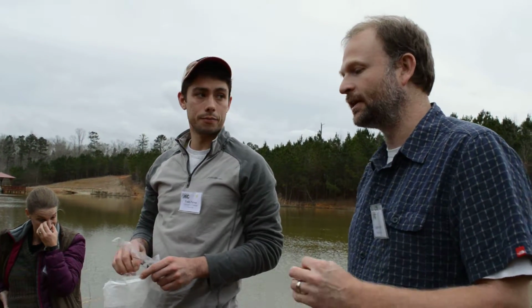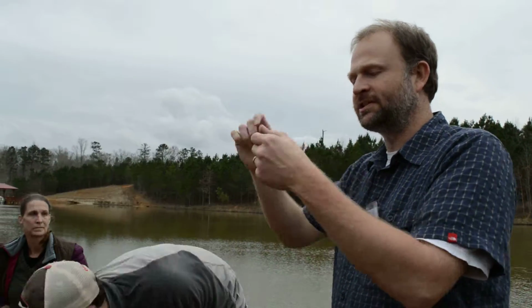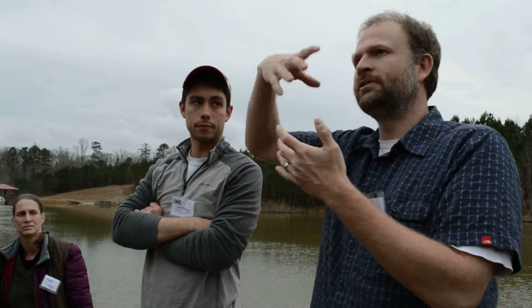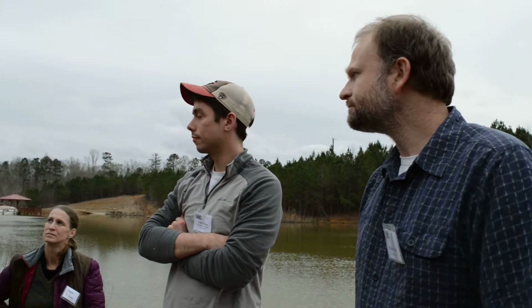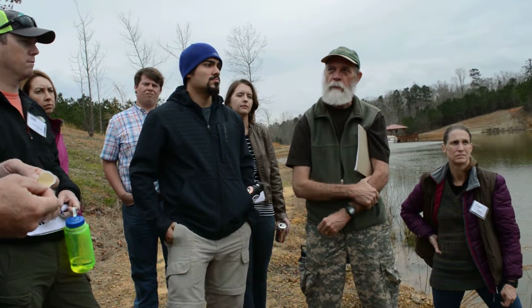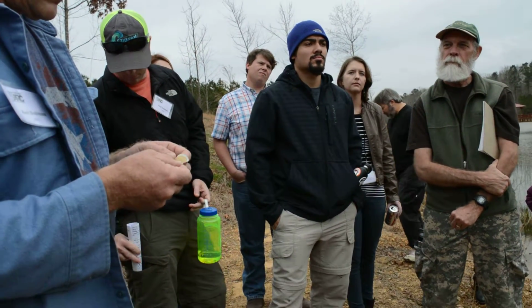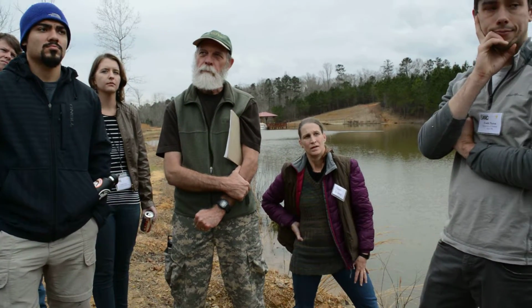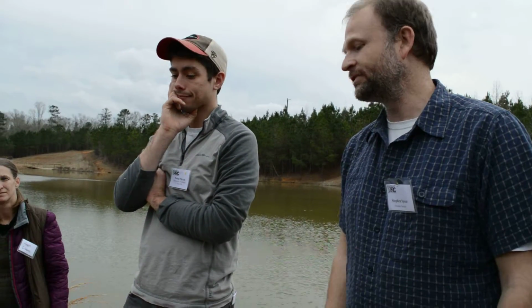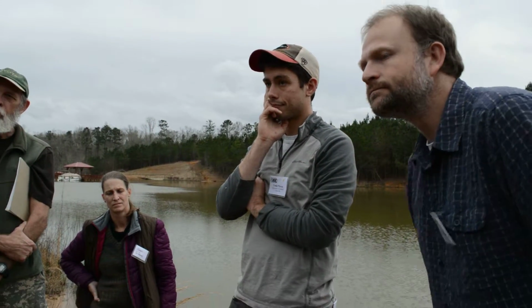We usually let it dry for at least several hours, sometimes overnight. We tear the filter up and then just have an open tube for all the ethanol to dry off. But with the CTAB, you're not going to save any of the filter. It gets destroyed in the process. Yeah. Okay. And I've never had to go back to the other half of the filter. It's there, so it's not like that's critical. That's a real problem if you're using a whole filter. Wow.